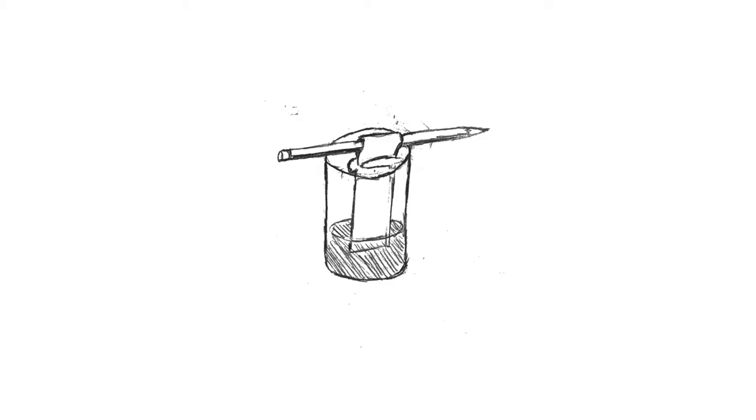Paper chromatography is done by putting the substance on a piece of paper and dipping the paper in some sort of liquid. For this lecture, that liquid will be nonpolar. This image shows exactly that, a piece of paper being suspended and dipped into the liquid. The substance is not present in this image, but you will see it in the next slide.